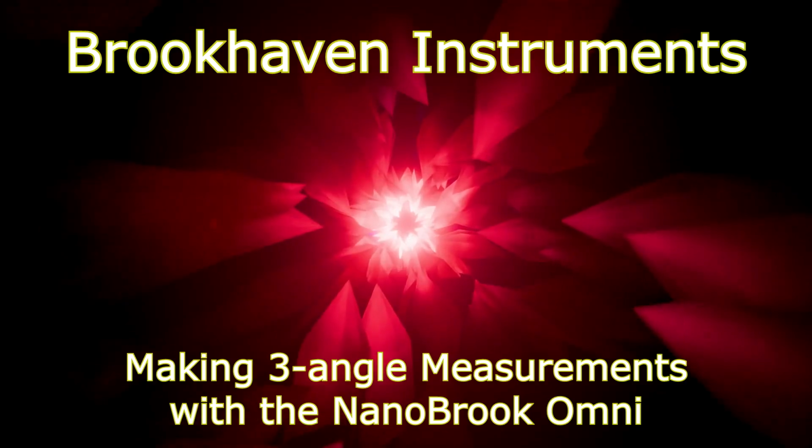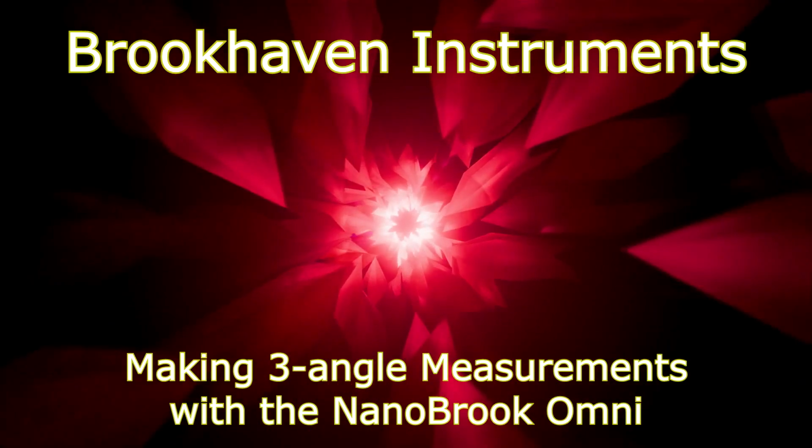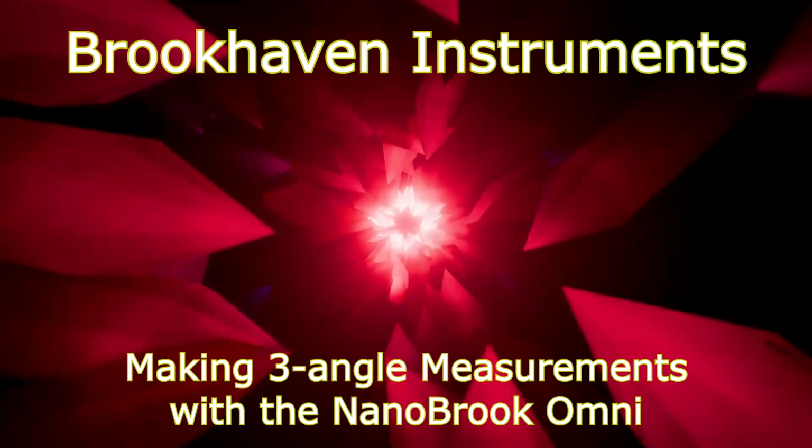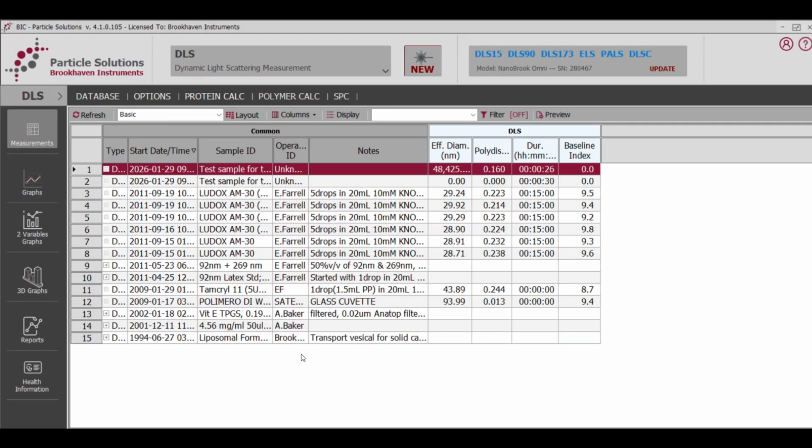Today we tackle how to make DLS measurements using the 3 angles of the NanoBrook Omni dynamic light scattering instrument. In this brief video, I will show you how to make dynamic light scattering measurements using each of the 3 angles with the Brookhaven Instruments NanoBrook Omni instrument.